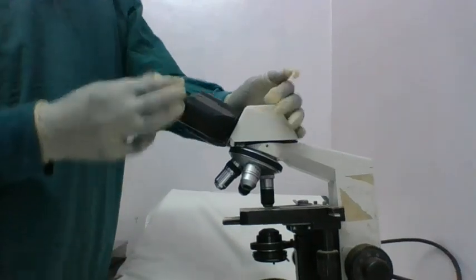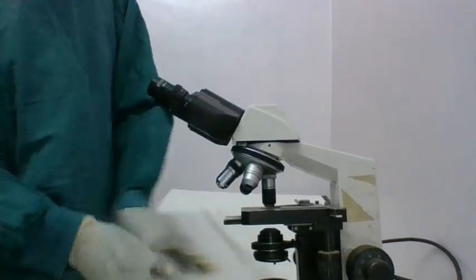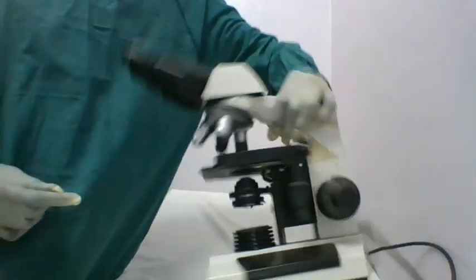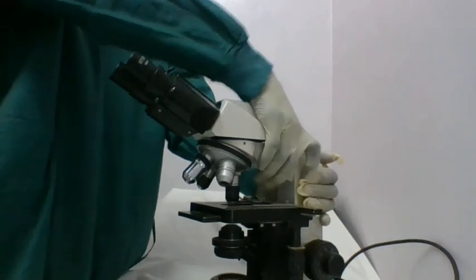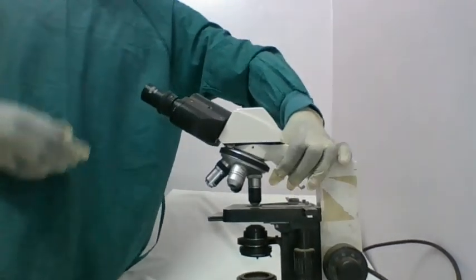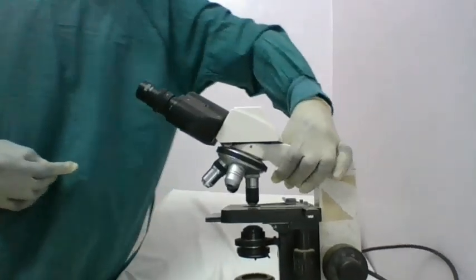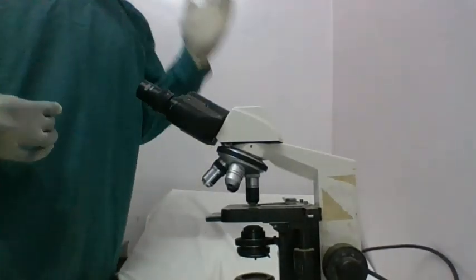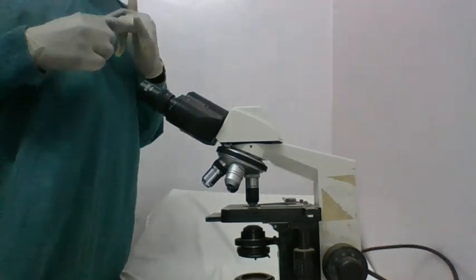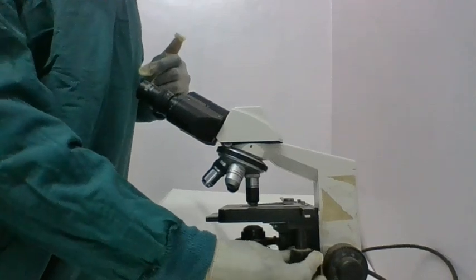So, what are the most important parts of a microscope? First, we have the handle. Here's the handle of the microscope that helps us to carry it around. If you want to move the microscope to another section or another place, this is the handle of the microscope, guys. And there are the adjusting knobs. You need to identify the adjusting knobs in case you want to adjust anything on your microscope, to move maybe the field.